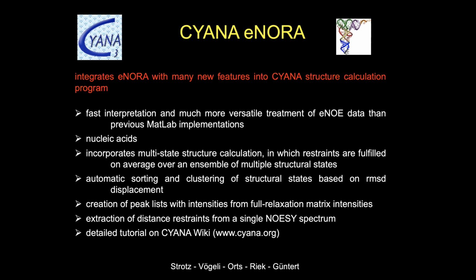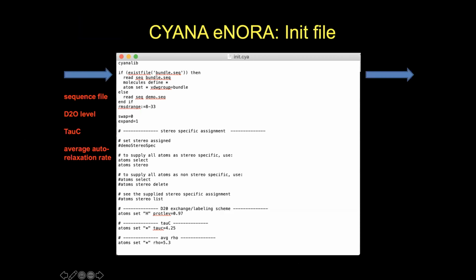And then we have a very detailed tutorial that is integrated into the Cyana Wiki webpage. We have a search window. You can enter commands you want to understand, and most of them are there. And this is still being updated by Dean Strotz, the guy mentioned here.